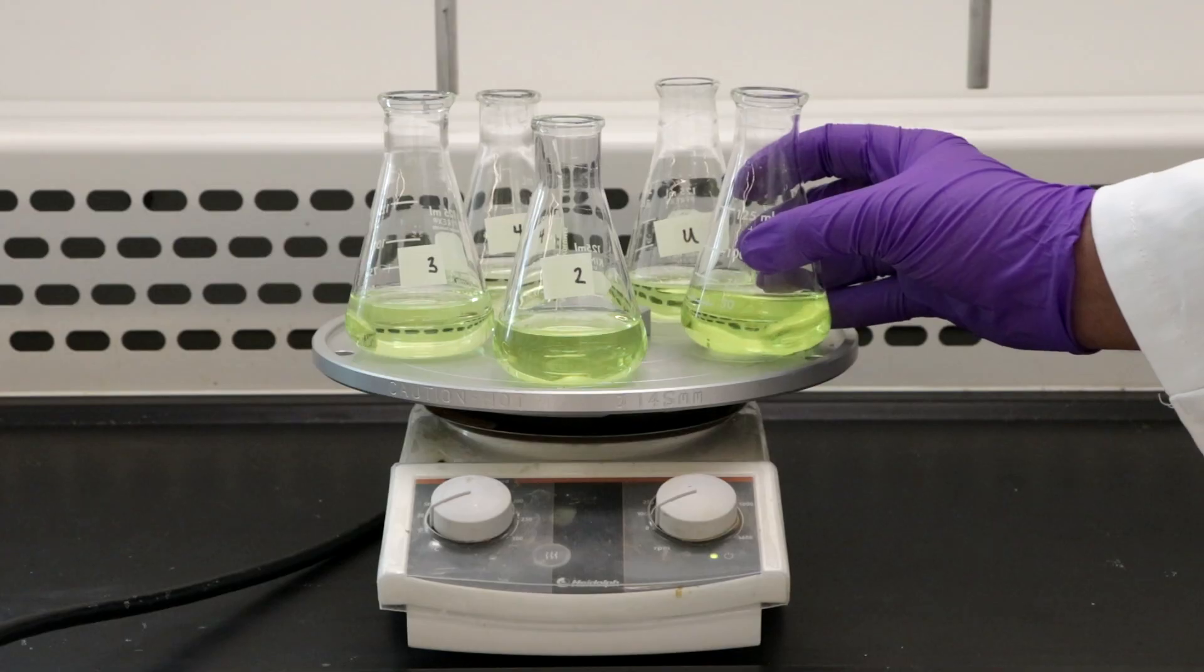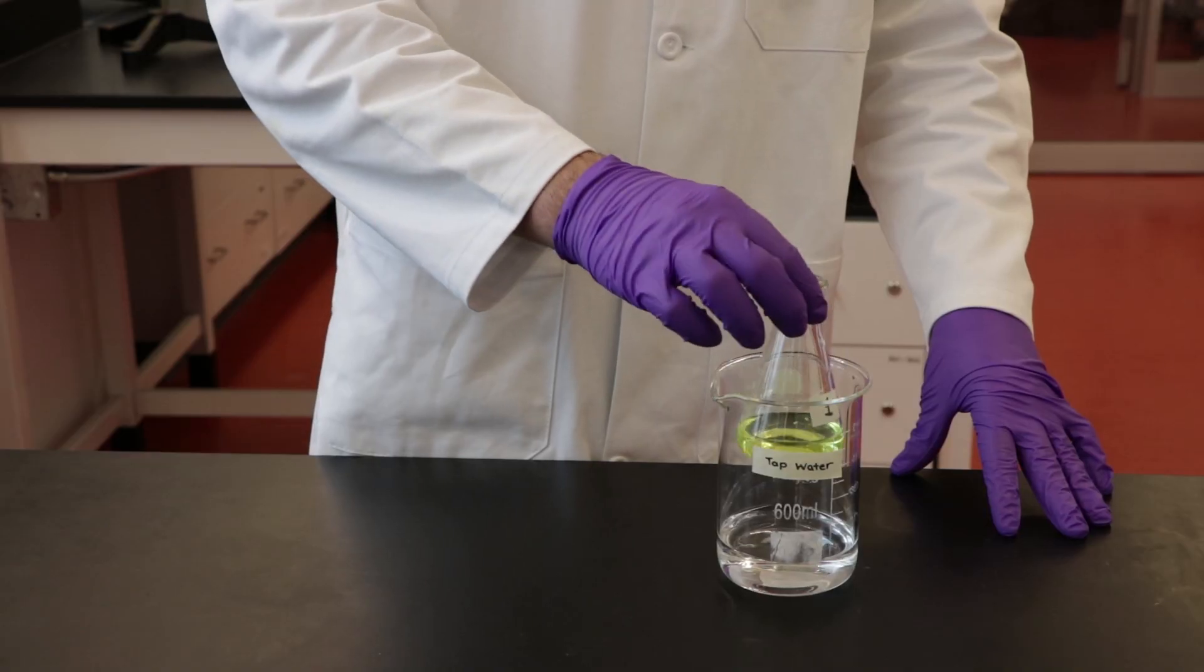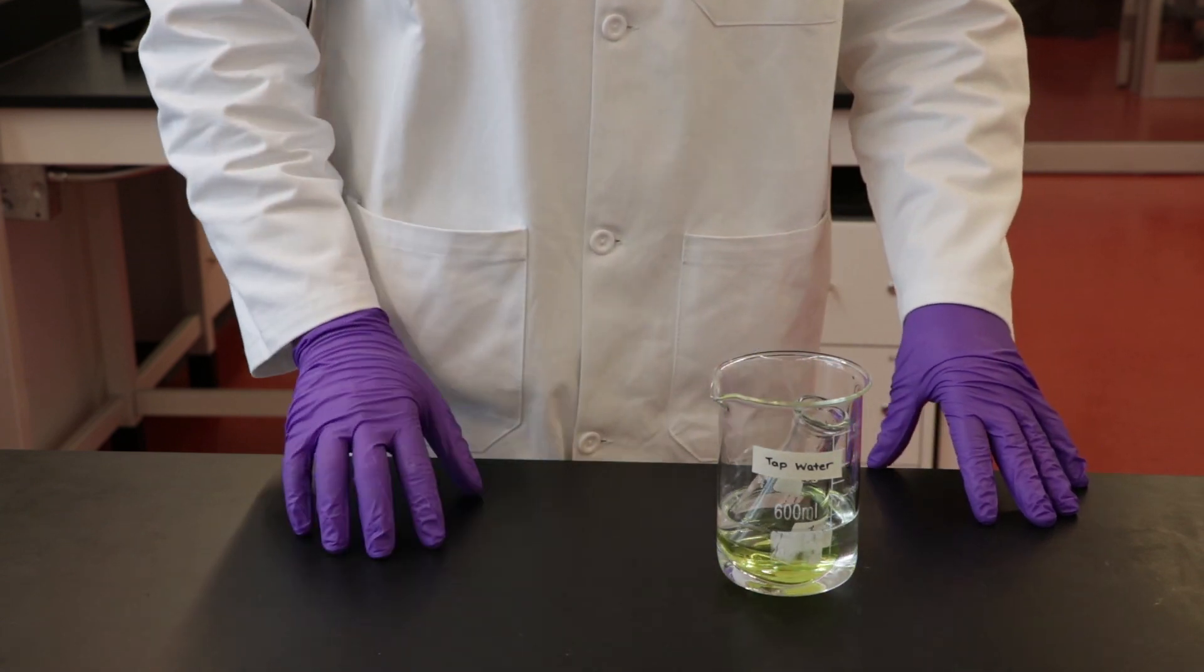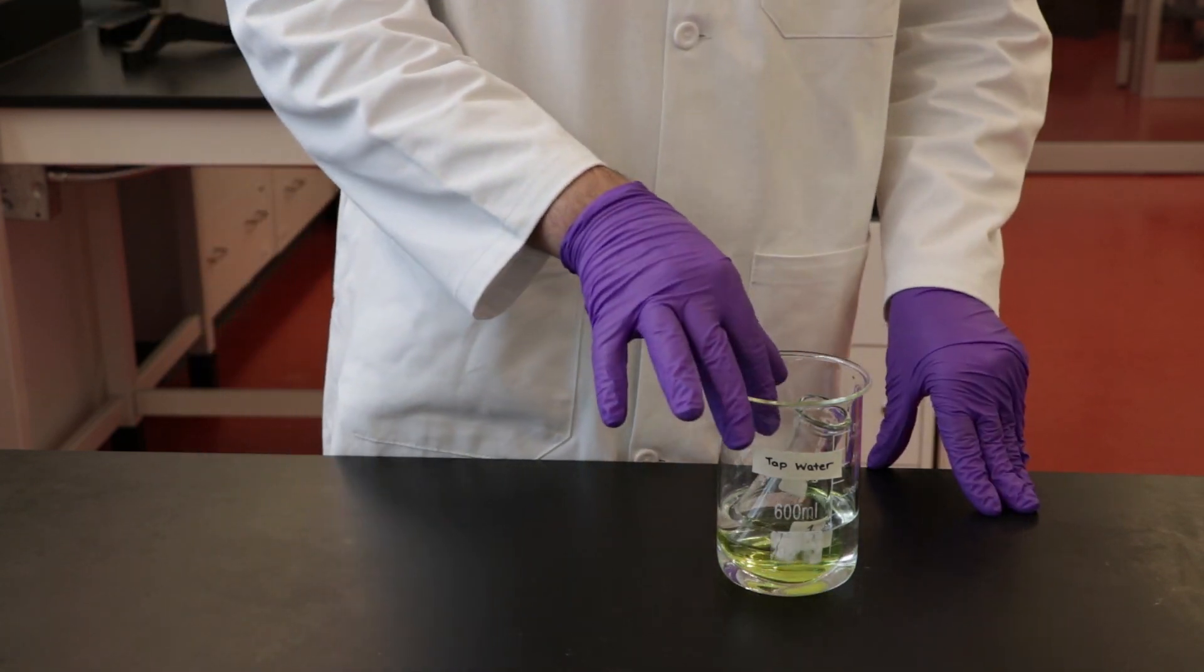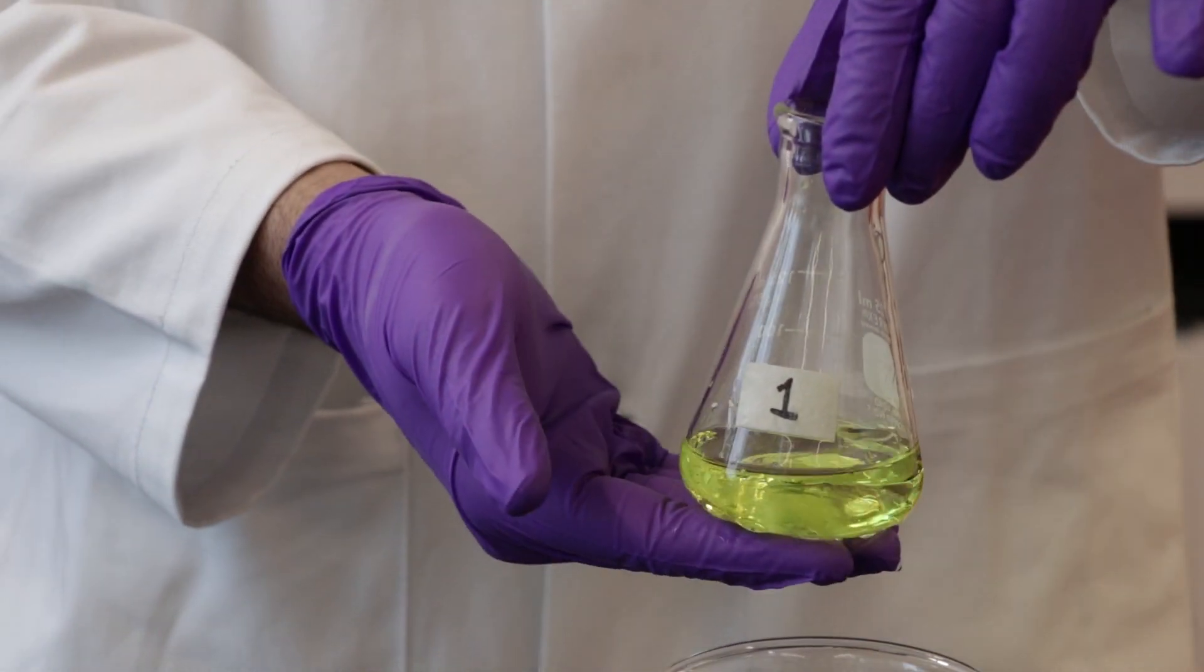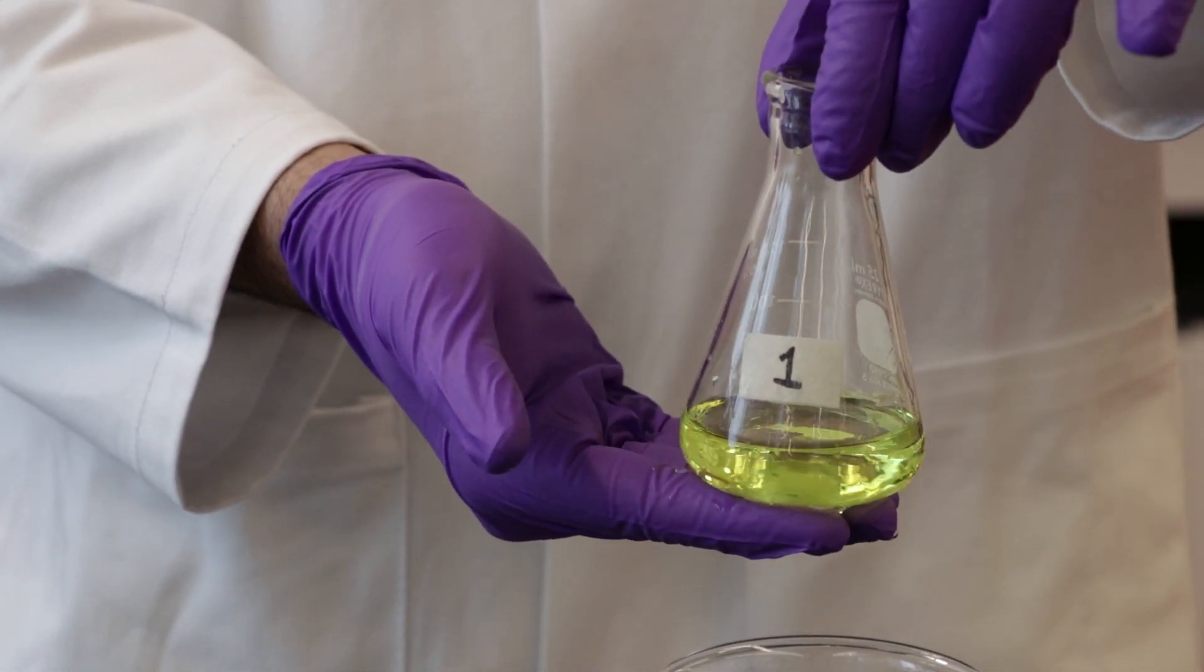After 15 minutes of simmering, remove the flasks from the hot plate and allow them to cool. This can be facilitated by placing the flask in a larger beaker with tap water. Once the flasks have cooled to the touch, you can move to the next step. You do not need a thermometer for this.